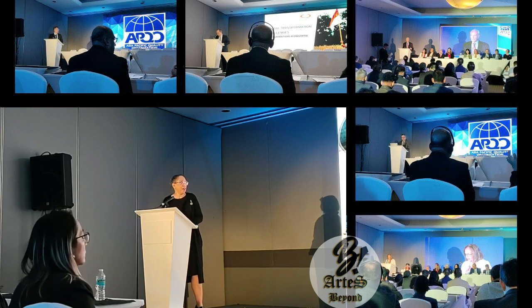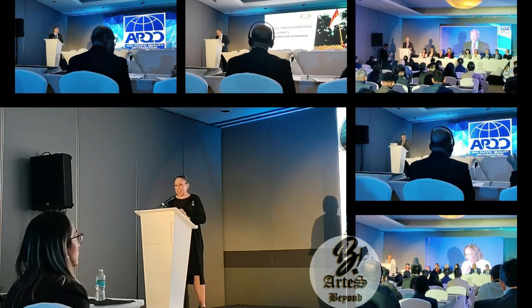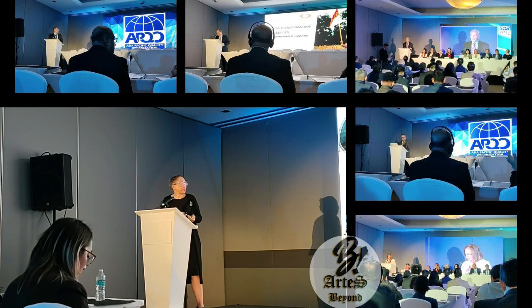Everything looks fine. A few months after, massive deaths of fish, juvenile fish affected. And they thought, well, what happened? We got it tested, we got the result, the particle size was right. What they didn't test for was particle shape. And the particle shape was like a needle. And when you do a particle size test, sometimes you don't pick up that shape. You've got a long needle and it's actually measuring the diameter. You don't know the length. So a standard test method was used. They did their best, but it was the wrong test method. And they didn't know it was the wrong test method.